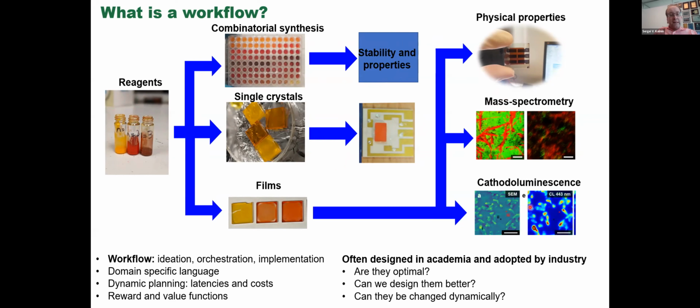So this is an example of a workflow that is implemented in a fairly small lab. All of us are familiar with that. If you work on batteries, you deal with one type of workflow. If you work with PLD growth, you deal with a different type of workflow. If you work in the chemical lab, this is the third type of workflow. The key element of this workflow is that we learn and we plan it dynamically.